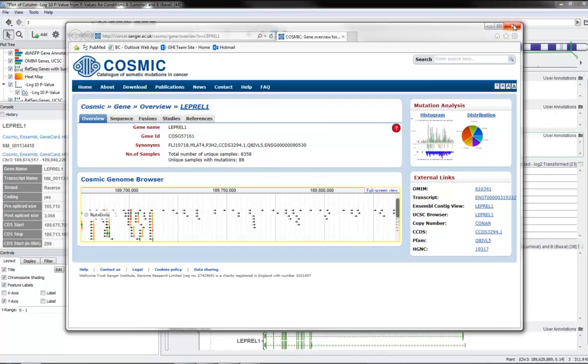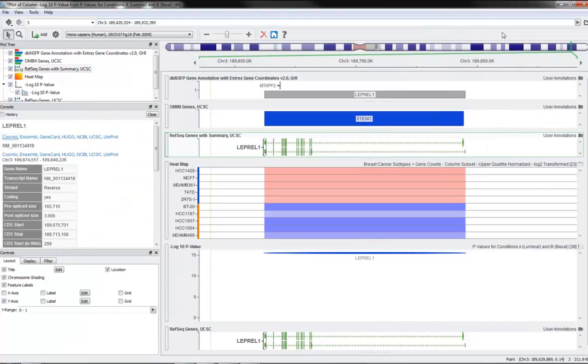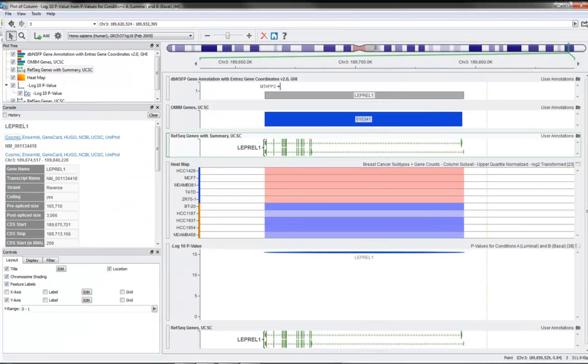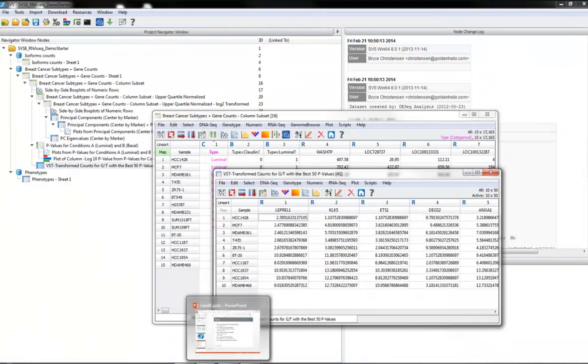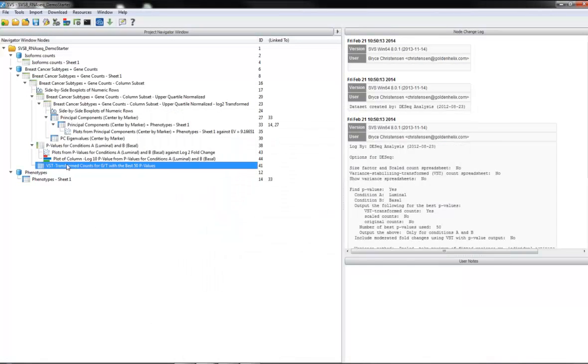Anyway, with that, I think we're at the place now that we can start to wrap this up. As we've gone through everything today, we have shown you a broad, oh, actually there's one more thing I wanted to show.